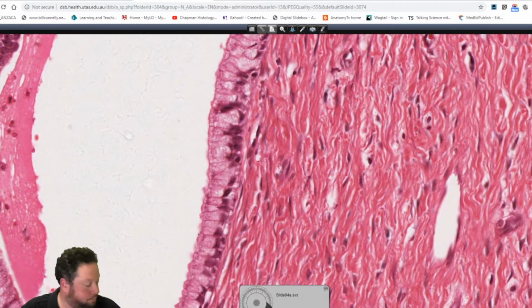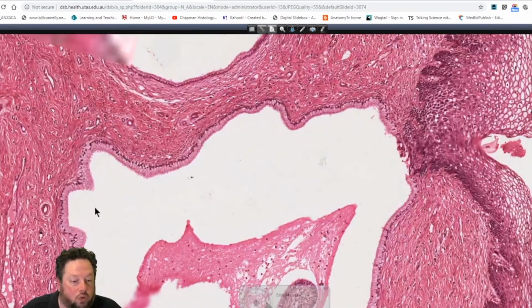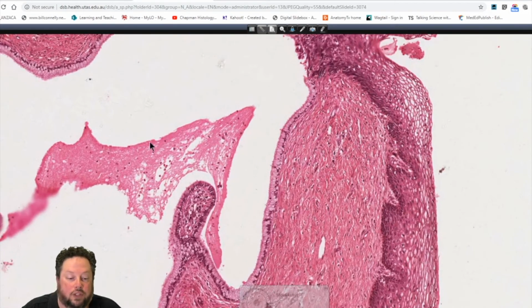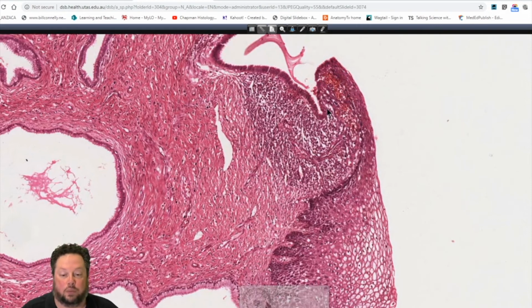Now, these are part of what, as I mentioned, was a former endocervical gland, and now has lost its connection. You can see where the duct would have been, and it's actually been disrupted, and they can't actually secrete onto the surface anymore. So therefore the secretion continues to build up here and causes these cysts to develop. So there's another one here.